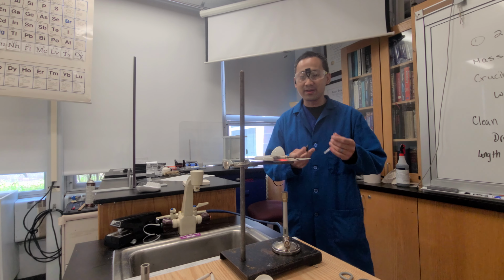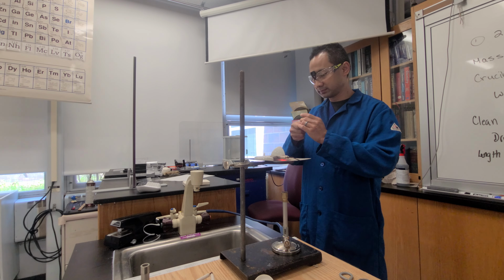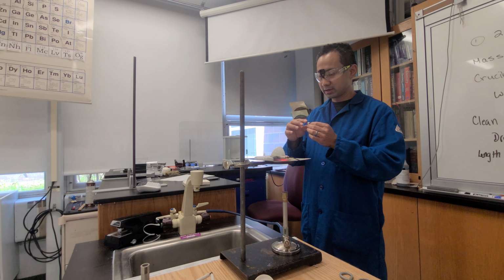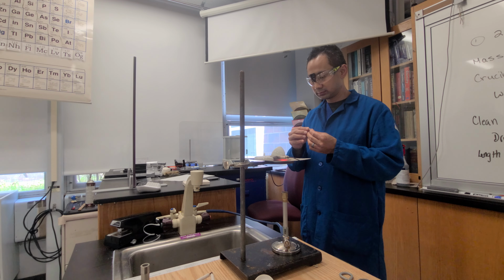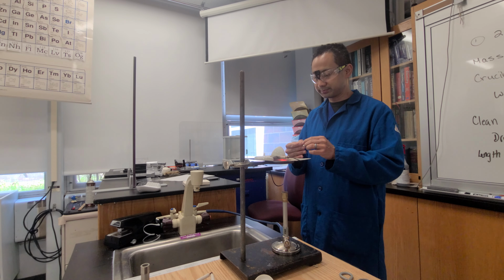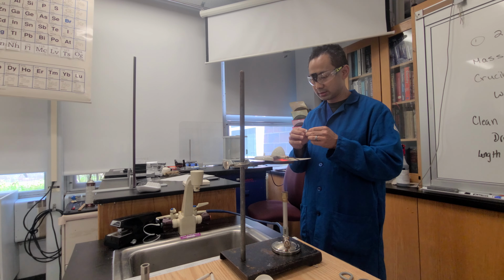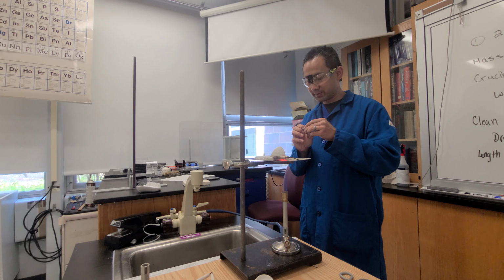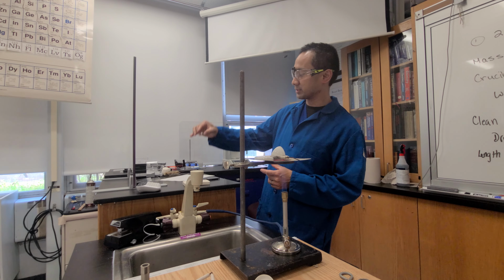Okay. To coil, I find that coiling, I'm just going to put it right on top of my pencil. And then I'm going to just slowly spring it out. And I think that's pretty good. You don't want to necessarily get into a nice little ball. Obviously you want to increase the surface area as best as possible, what's going to contact onto the disc. So I'm trying to get as much contact as possible. Yeah, I kind of like that. I'm going to drop it just like that.